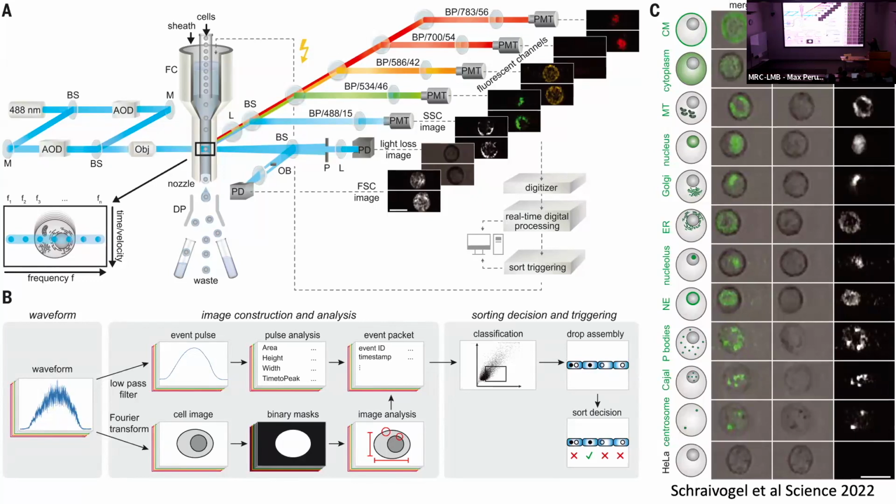It is about that, I think, with this particular pipeline. But you're able to get this kind of resolution, and at the same time you're getting an image and you're actually purifying populations of interest. So now you're able to link more morphology.